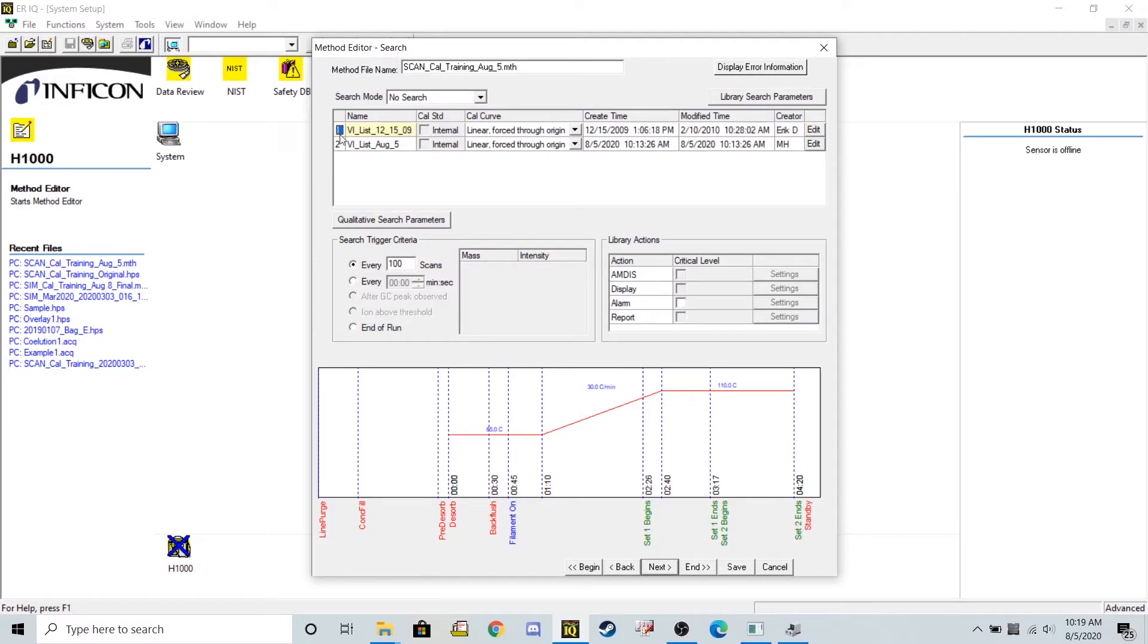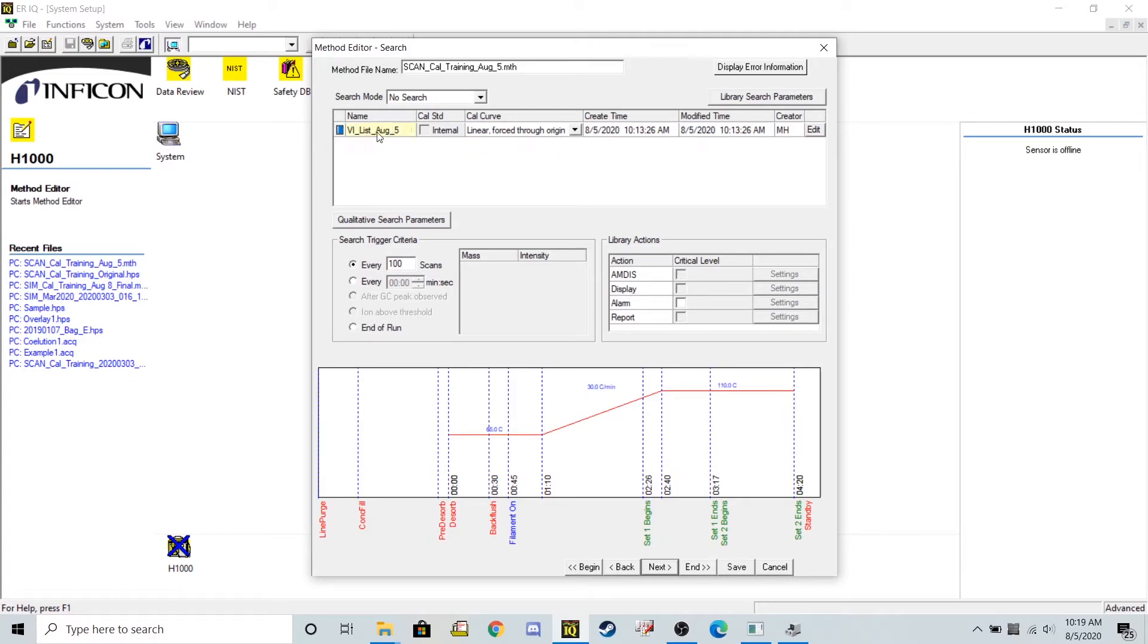I'm going to get rid of the library that was created before, not by me. And I'm only going to leave the library that I just created earlier. Let's go ahead and save this method.